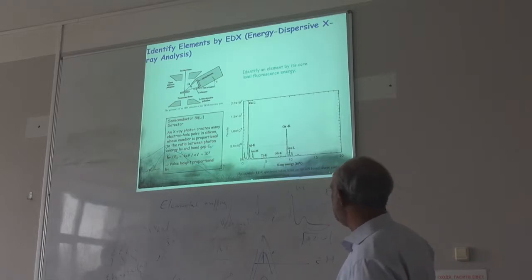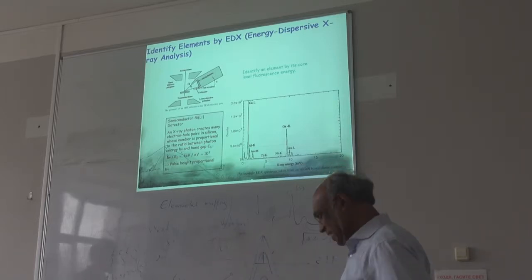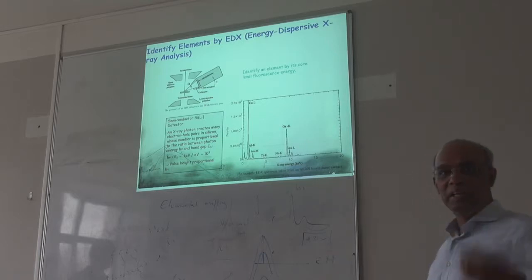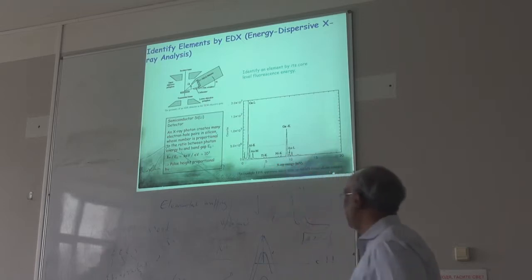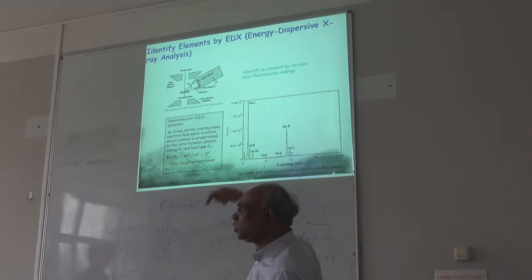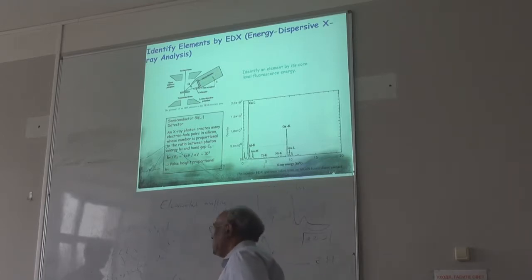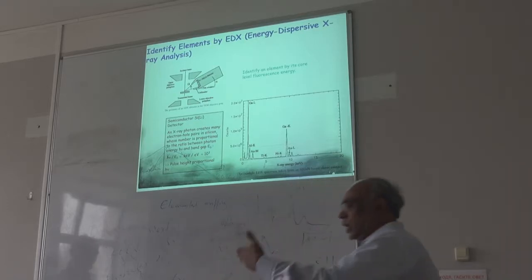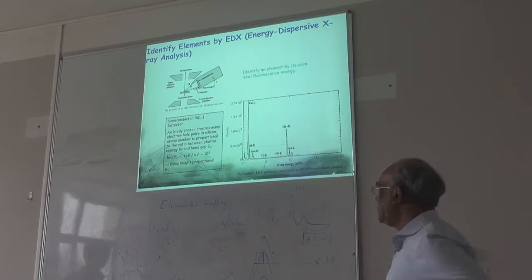Okay. Yeah, I could give one lecture on the energy dispersive technique. I need to prepare some talks for next year also. Maybe that's something we can think about. Yeah. Also this EDS you can do not just with electrons, you can even do it with incoming X-rays, because you can knock out these electrons. But since we are using the electron microscope, we can use that energy directly.